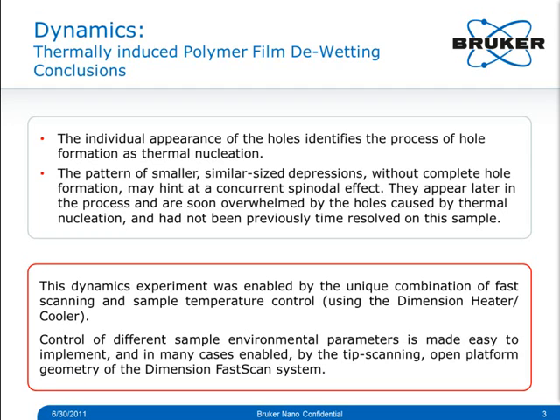This concludes our session on the thermally induced polymer film de-wetting, imaged by the Dimension FastScan and the Dimension Heater Cooler.